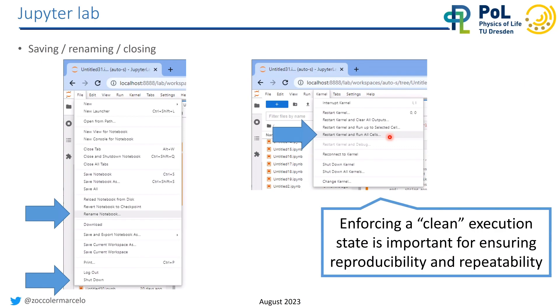Always try to have a clean execution state. Because you can execute cells out of order, which is fine while you're still trying things out, but if you send this notebook to somebody else and they try to run it, there may be errors because the execution order was wrong. Always try to see for yourself if your cells work from top to bottom in the right order.